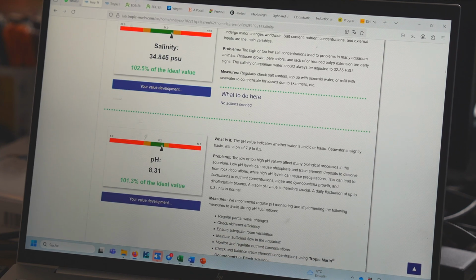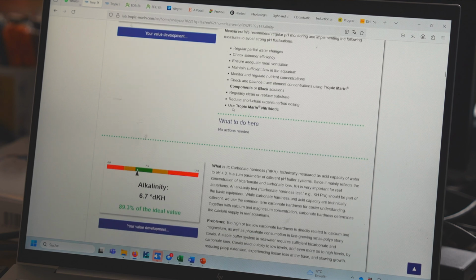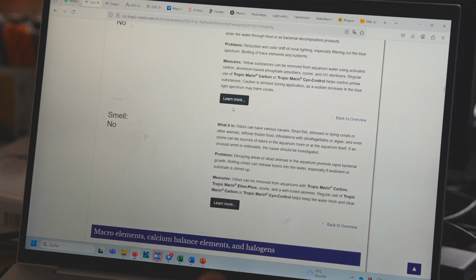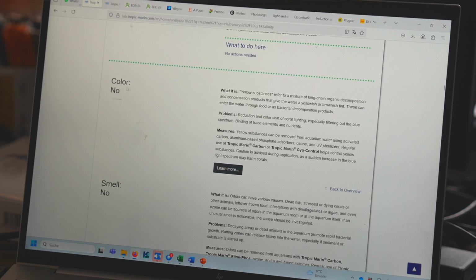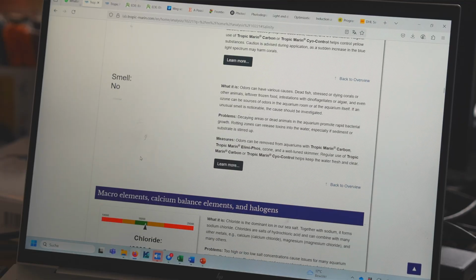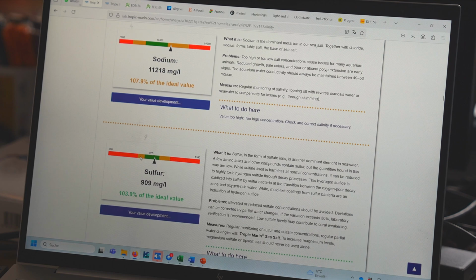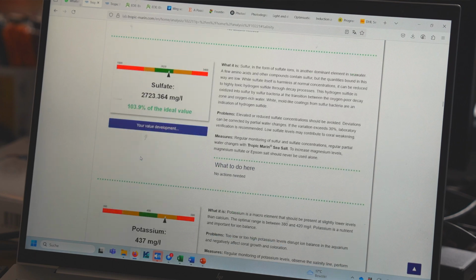So here we don't need to do anything because that's all good. And now we can scroll through here. They also check for coloration, because discoloration can be an indication of organic compounds in the water that you don't want to have. And a smell test is also done, because that can also be an indication of certain problems. We have the macros again, also with the description of what they do, what happens if you're outside the range, and what you should do.